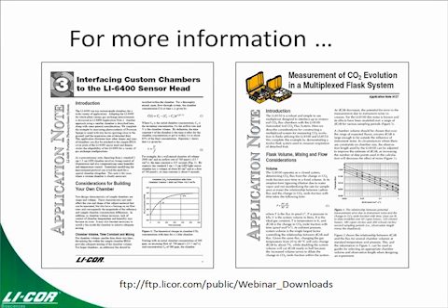With either one of these, the kits come with the application notes that we referred to earlier, but you can get the application notes for free online and look at them, and they provide a lot of good hints on how to interface chambers, and maybe you've already got the parts laying around the lab that you need. It's possible.